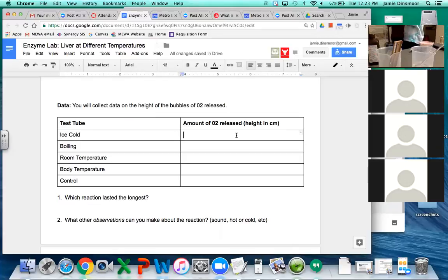Oh my gosh. This chicken liver in your hair. Smells like fire over there. Does it smell? It does. Yeah, it does smell really bad. It doesn't smell that bad. Do you want to smell? I thought you were having multiple chicken livers. There's like 10 in there. How many chicken livers do you want? This looks like a cow's tongue. Very tongue-like, even though I don't know.